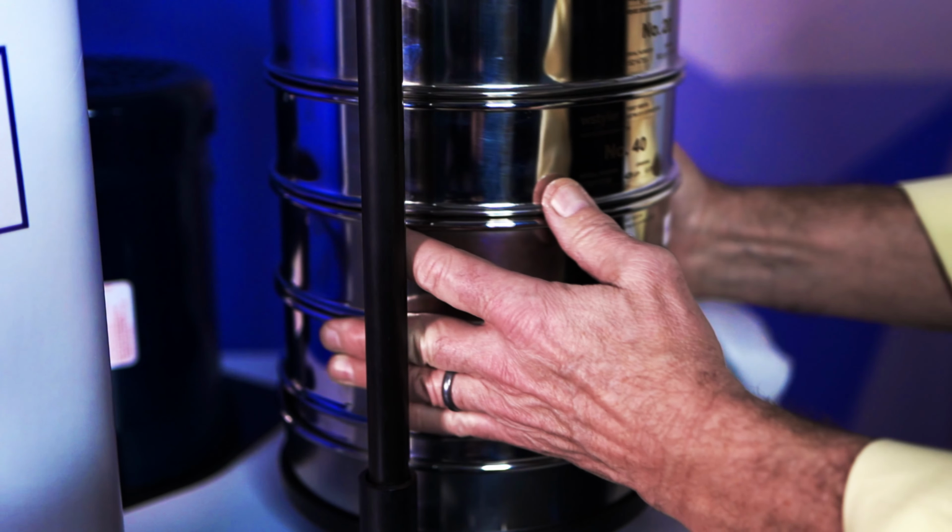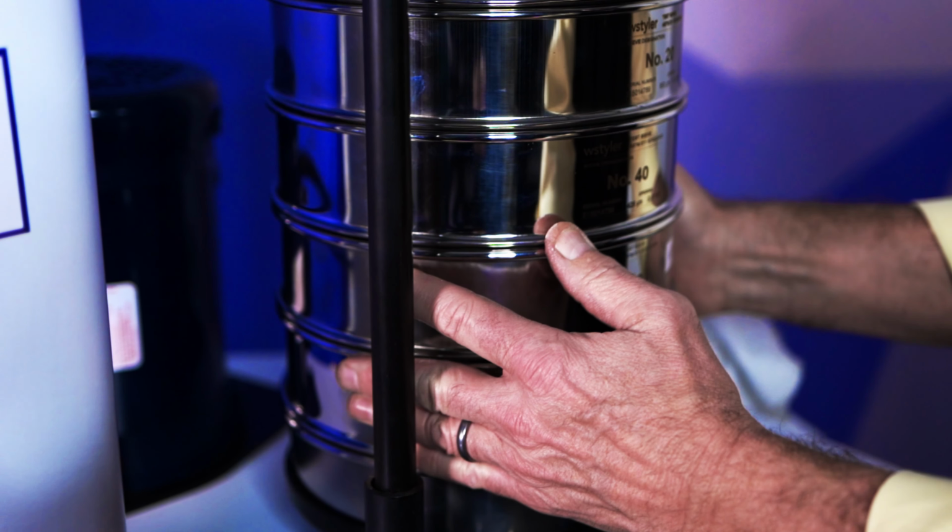The row tap can hold a stack of sieves anywhere from 1 to 13 sieves high. Although 6 full-height sieves is the most common, you can use half-height sieves to allow the 13 to fit. But don't worry, your industry standards will usually tell you how many sieves you need to use for your analysis.